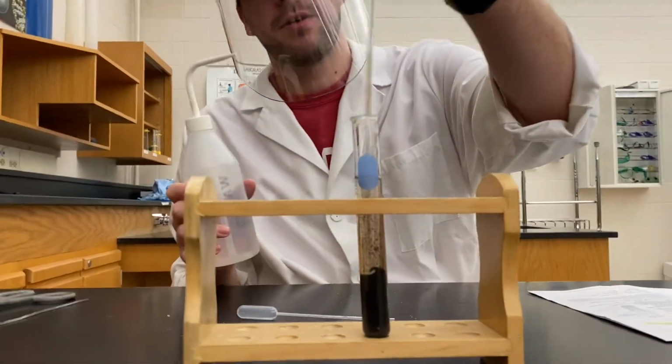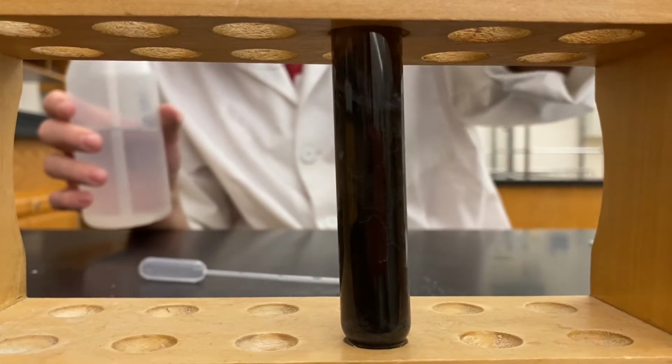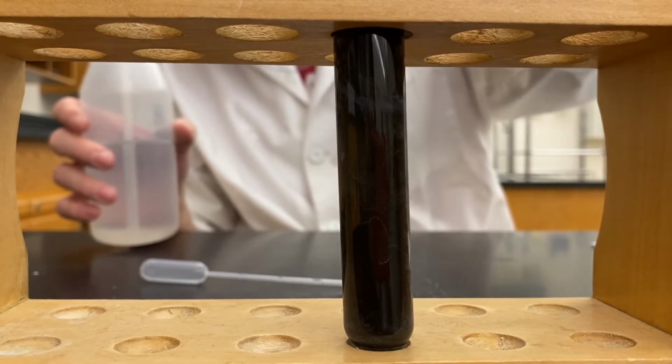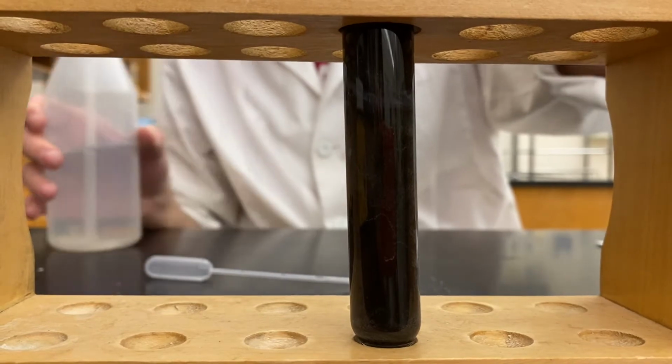Mix this, see if I've added enough of the acid. Did not.